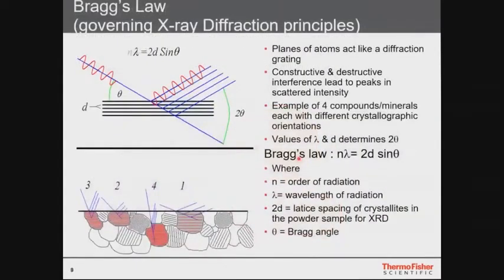So what is X-ray diffraction? I know that there are some people in this call who are maybe bigger experts than I am, but I want to try to give a brief introduction to everyone. So maybe you remember your physics class in school or maybe in university. There is an experiment where you do diffraction of a laser beam at a slit or grating. And behind this grating, you get a diffraction pattern, which consists of minima and maxima. And from these, you can get some information on the slit size of the grating.